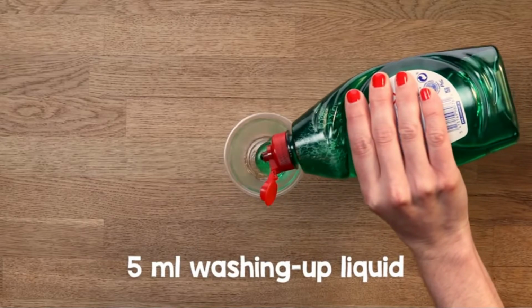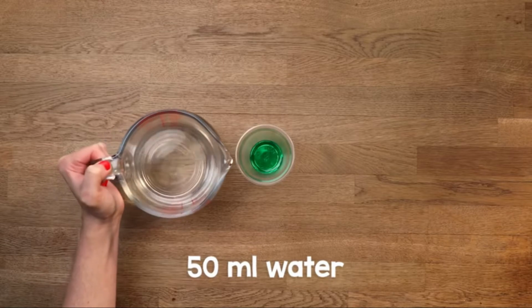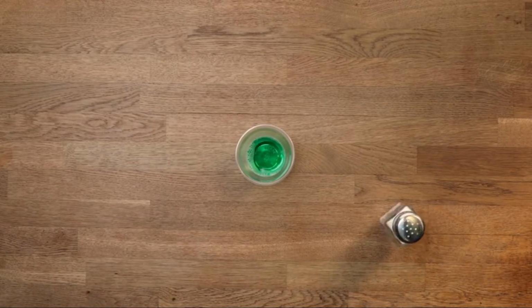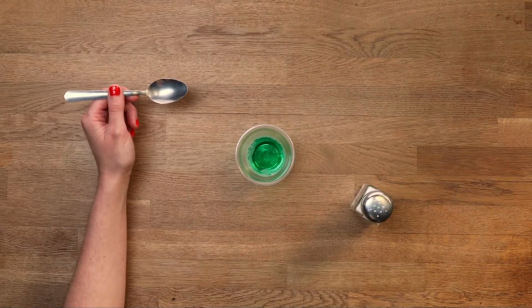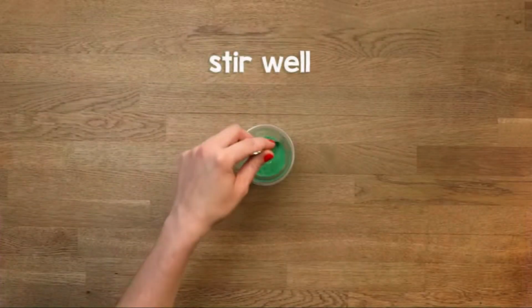Take 5 milliliters of washing up liquid. Take 50 milliliters of water. And 5 grams of salt. Then stir well.